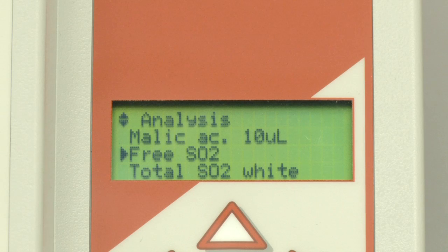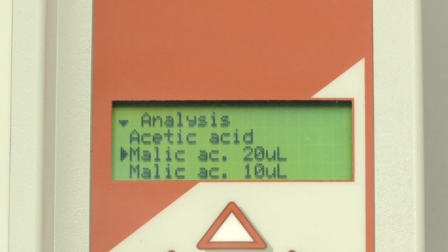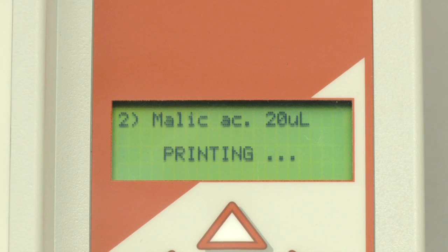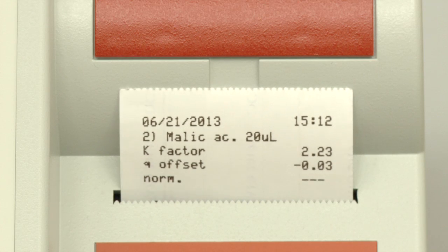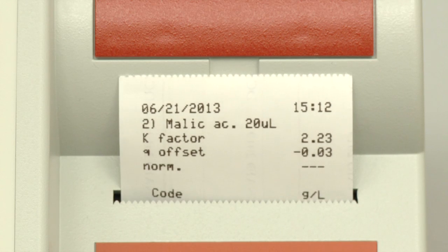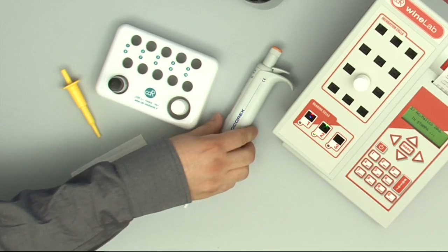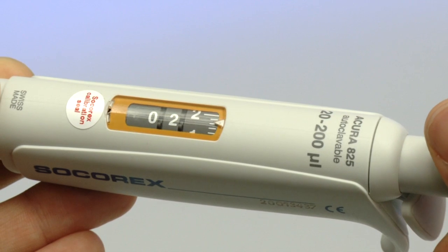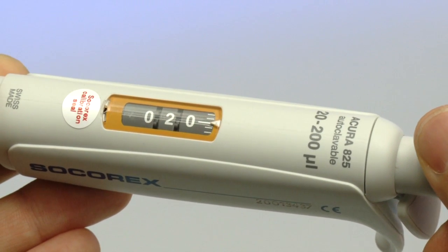From the main menu, select the malic acid curve test, 20 microlitres, and press Enter. The test parameters are printed and incubation one minute displays. Adjust the volume of the Socceret's 20–200 microlitre pipette to 20 microlitres.